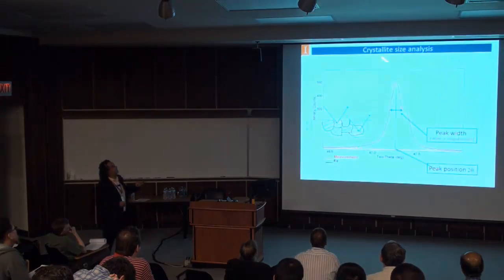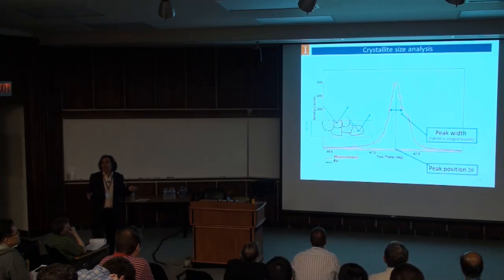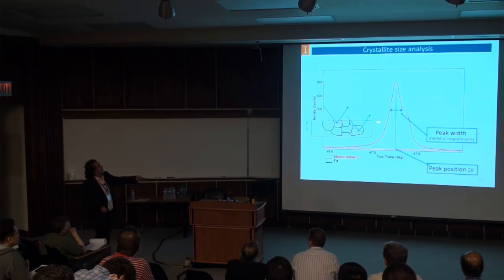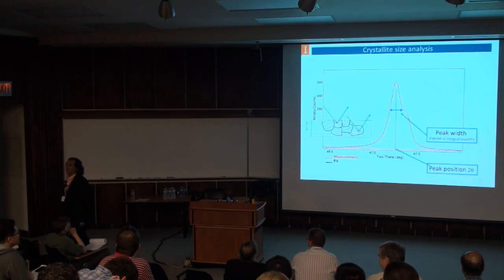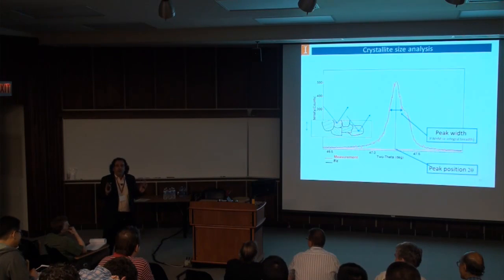Oh, this one. This can be a source of fight in the lab sometimes. Grain size analysis. Many people come almost in tears. I don't know what's happening. I measure my X-ray data here and I get a grain size, and I go to the SEM, it's different. My boss is giving me a hard time. My wife doesn't talk to me. My dog doesn't even bark at me at home. You have to help me with that. What is going on? Take it easy.